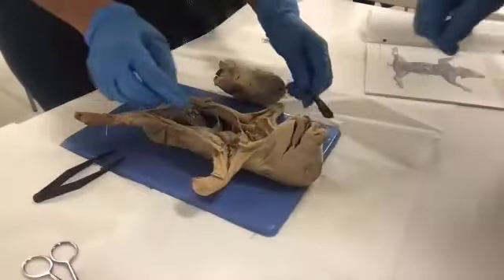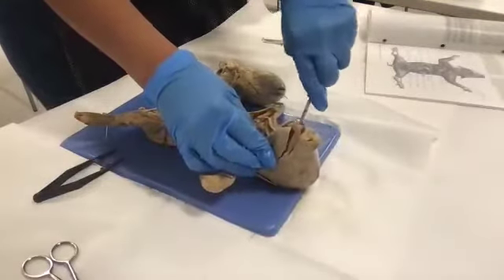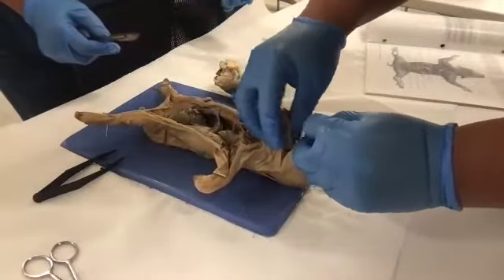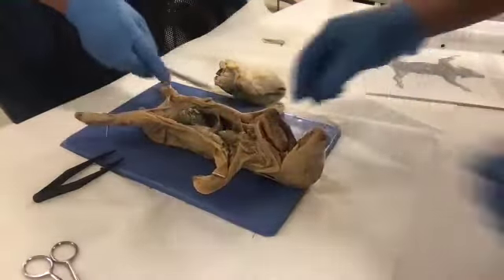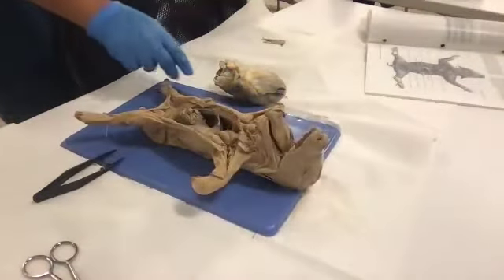Cut all the way down? Well, enough so that we can open it. Yeah. A little bit deeper, because what I'm going to ask you to do now is once you have that, let's do this. And you got to be wary of Piggy's teeth. Just break it open. Okay. So let's look at the tongue and feel the heart. Doesn't it feel the same thing?